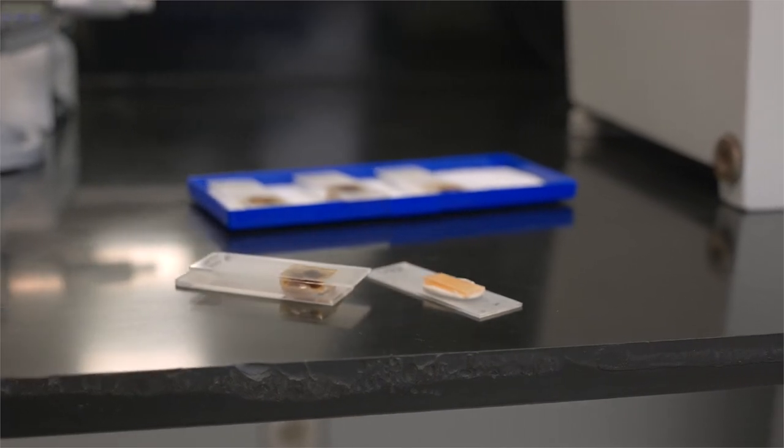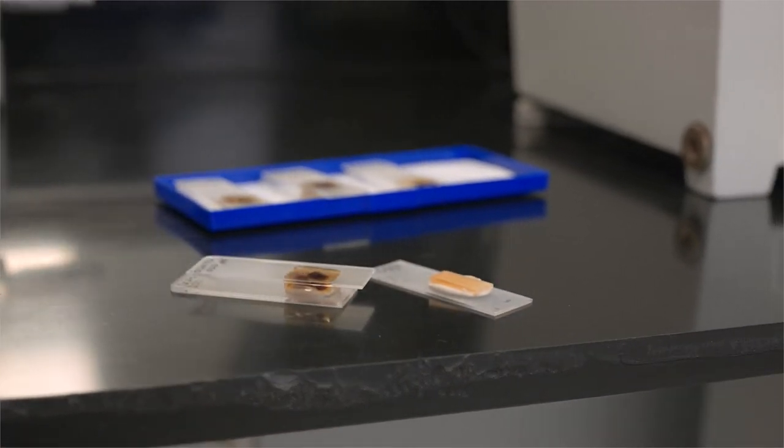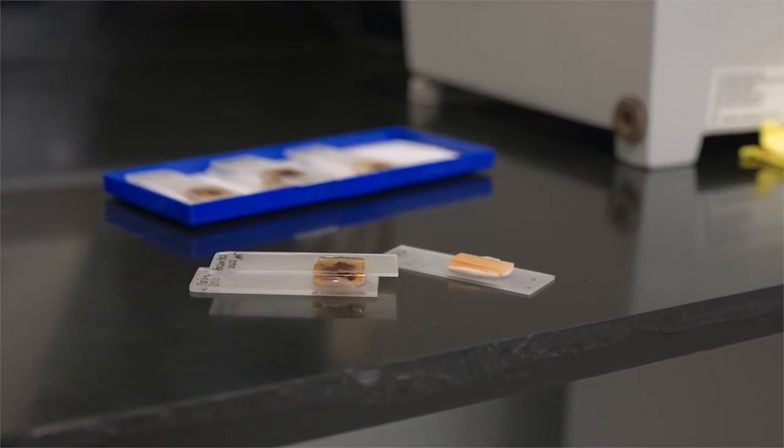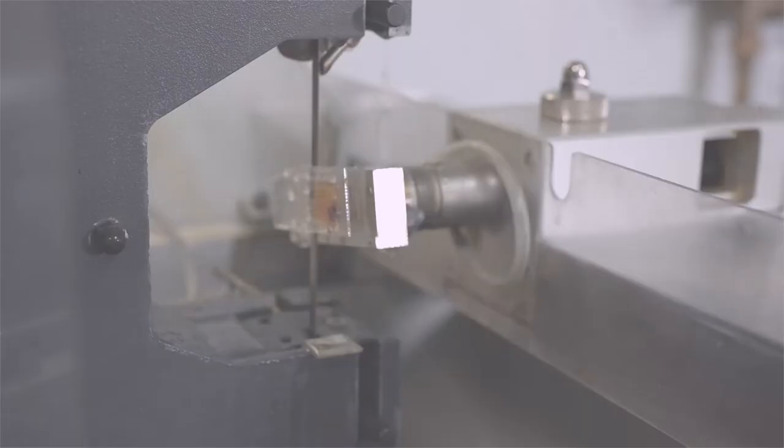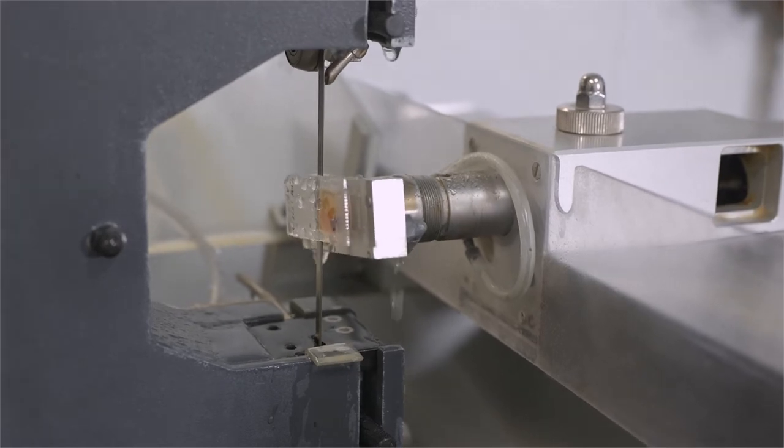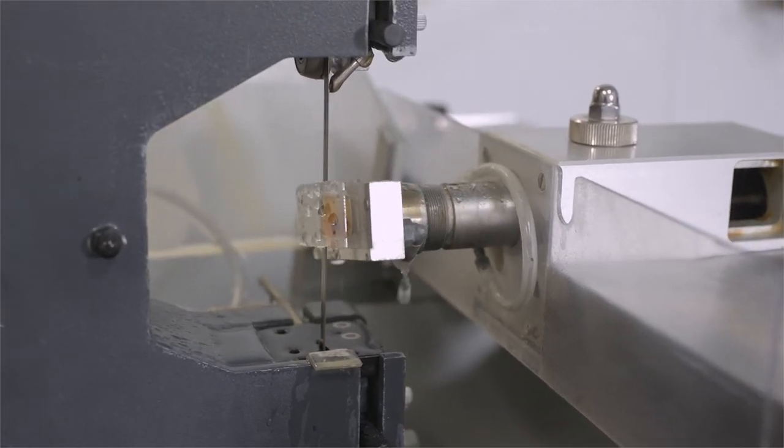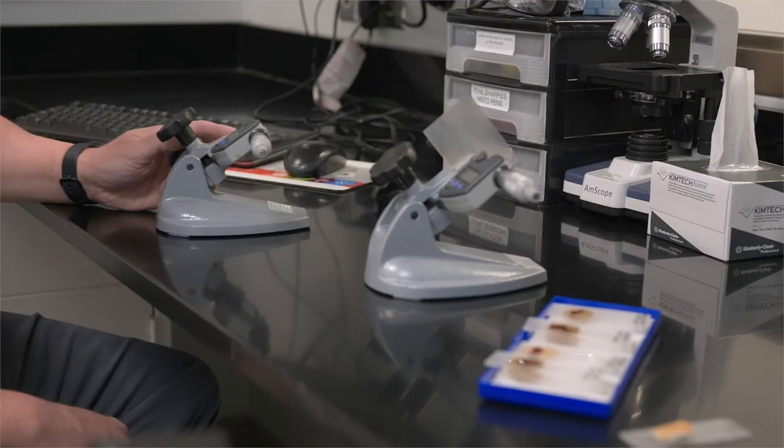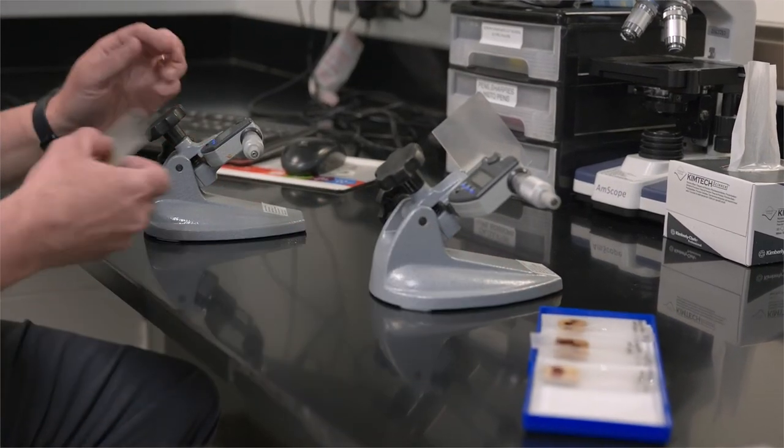Blocks are attached to base slides which we call half sandwiches. A final slide is glued to the other side of the block and we call this a whole sandwich. The final slide along with a 300 micron thick sample is cut off using the exact band saw. Again, weights and oscillation assist with cutting through the block.